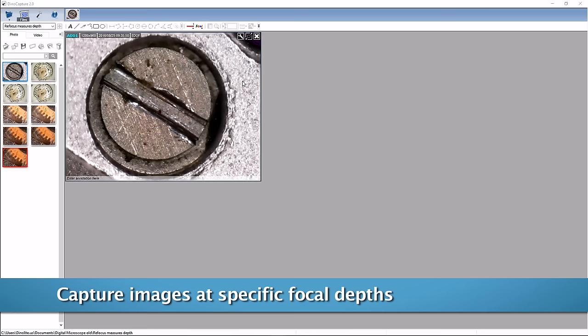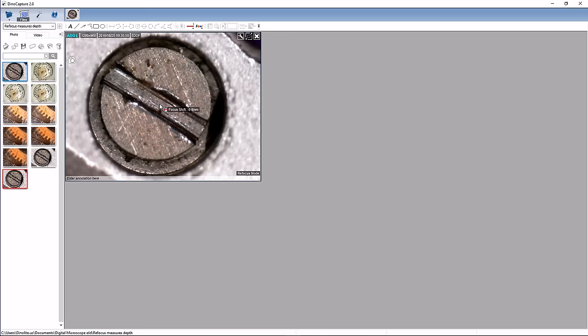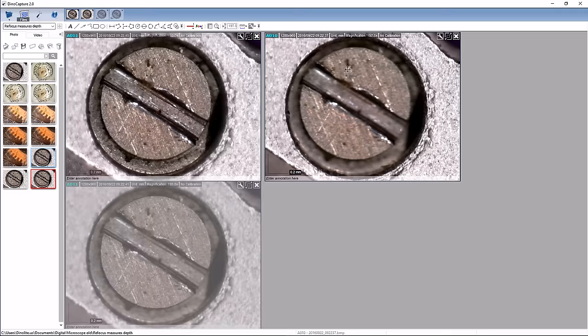Click on the camera icon to capture an image. Press the escape key or left-click in the window to exit refocus mode.